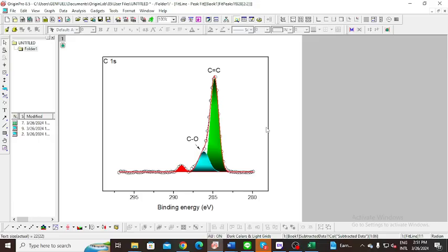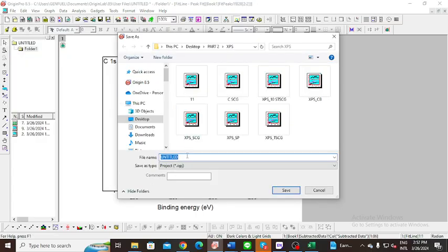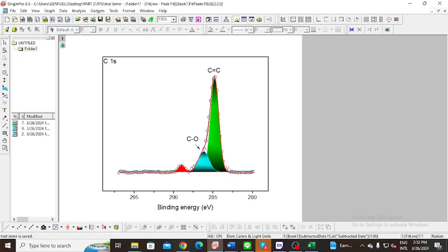Do you mind if you can send me one of these files so I can practice? Maybe this one I can just save as, and then I can open it on my computer to practice. Yeah, because I think we saved it before, as 11 or something like that. It's for the other one, just trial or anything, it doesn't matter. Do you mind if I get a copy of your Excel file so I can practice doing the other ones? Yeah, it's okay. I'll send it to you.